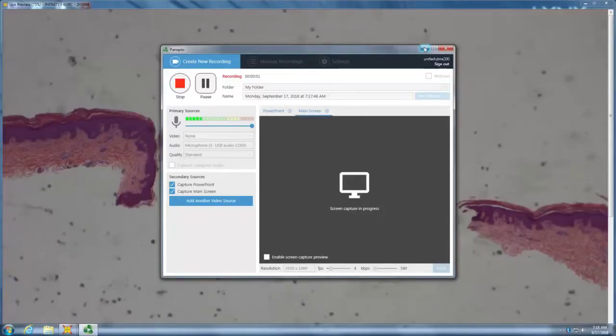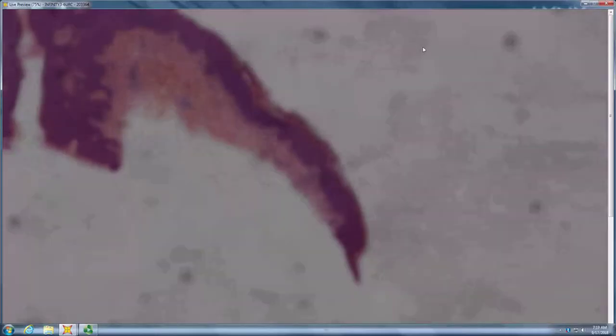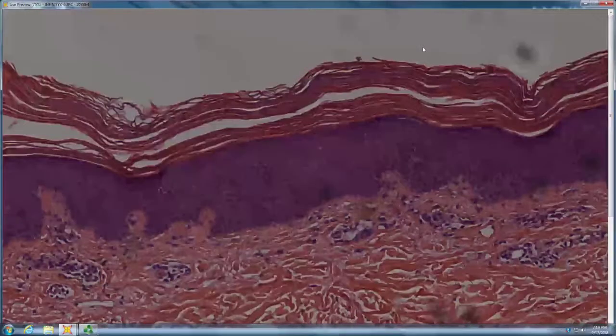Okay, so we should be off and running. Let's get everybody in focus. You got seats up at the scope? Over here. Richard's. I think. Far away. Oh, no, we're popping.